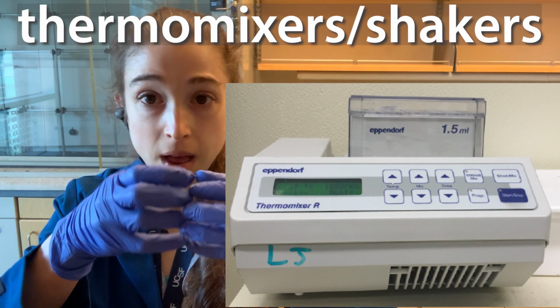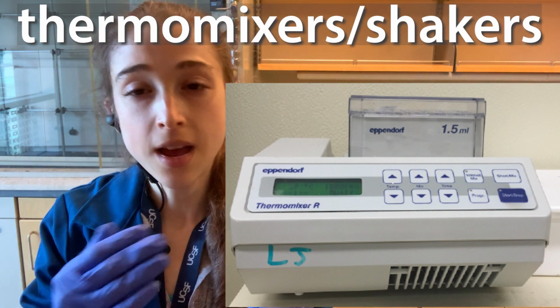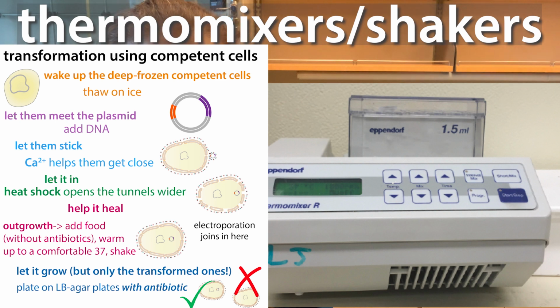These are basically blocks on top of a heat controlled orbital shaker, and so they'll shake. You can also turn off the shaker if you don't want shaking. A really common use that we have for these is bacterial recovery and outgrowths after a transformation. With a transformation, we can stick a piece of DNA, typically a circular plasmid containing some gene we want bacteria to express for us, so get them to make a protein, say.